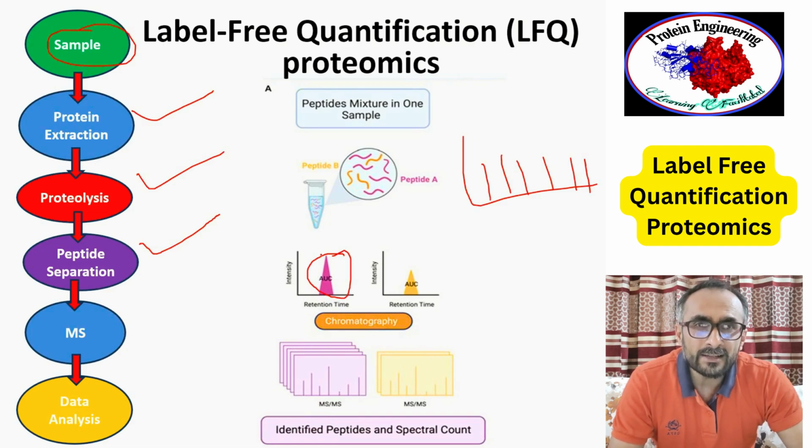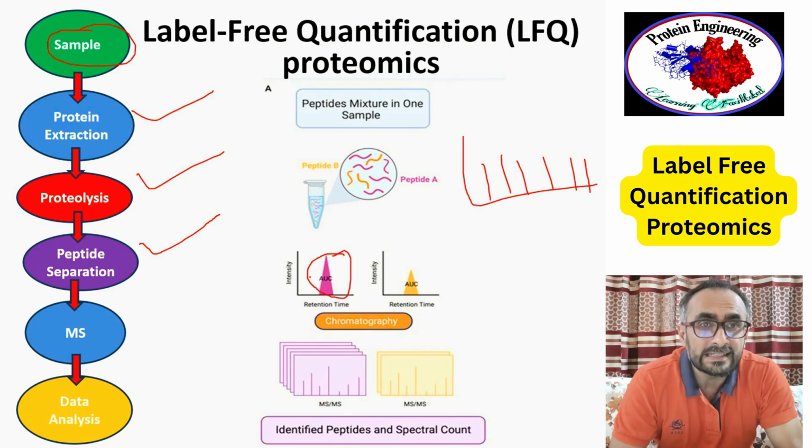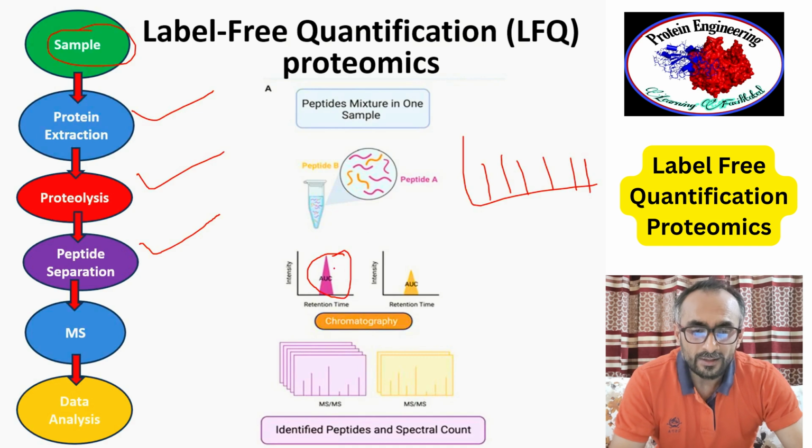Now the quantity, the amount of the peptide, in turn reflects the concentration of the protein it is coming from after peptide hydrolysis. So from here you will know the concentration of each peptide coming from your sample after digestion.